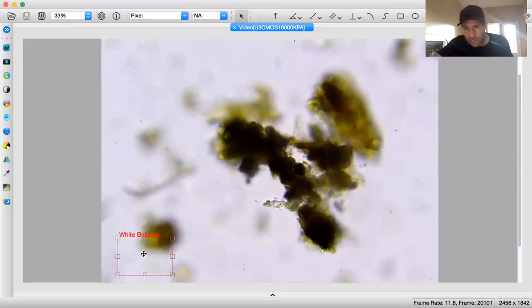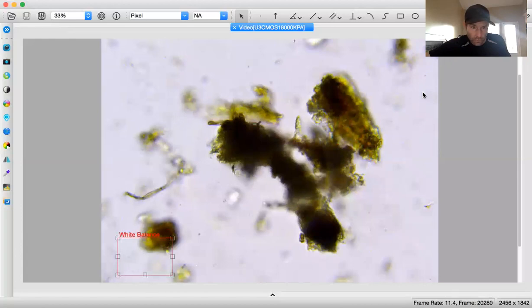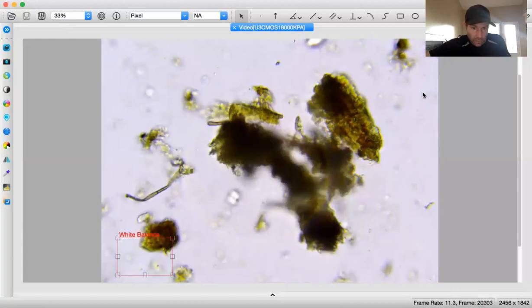That is a flagellate right here. Yep. Okay, flagellate number 2. And that's the same motion that was in the last one, so we should be agreeing on that. So flagellate 2. And again, I'm going to go back and just record that fungi as, I'm going to say, it looks like about 1.5 here, and that looks about 2.